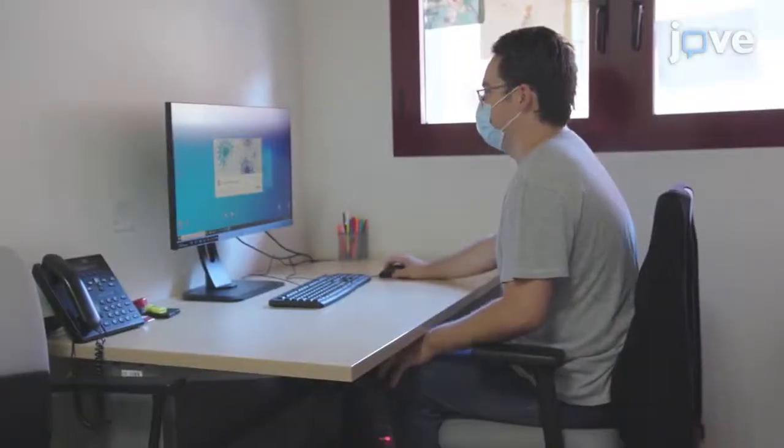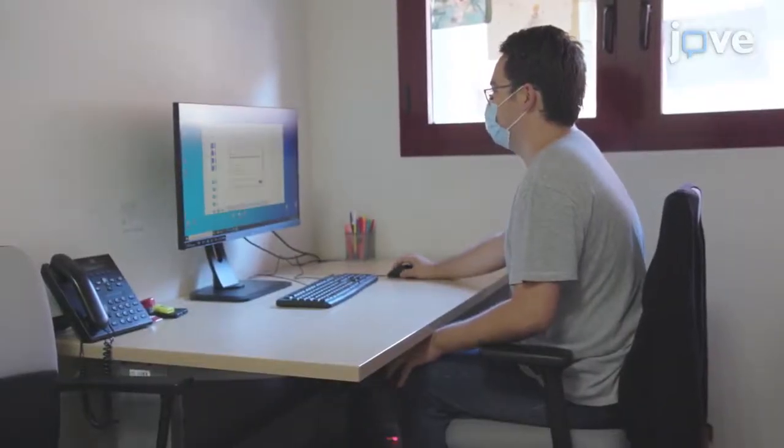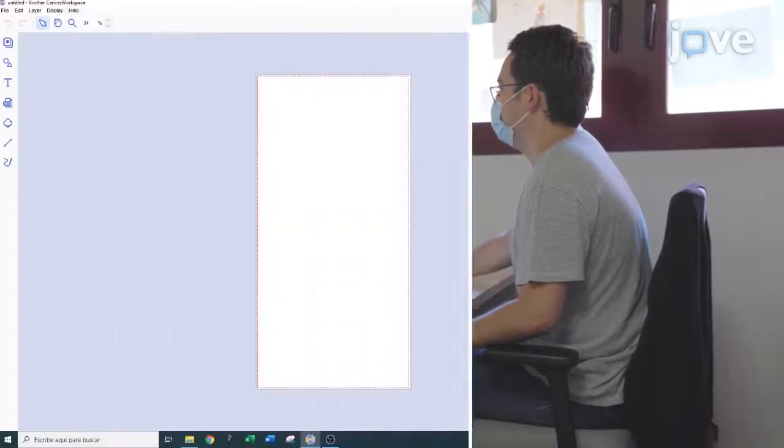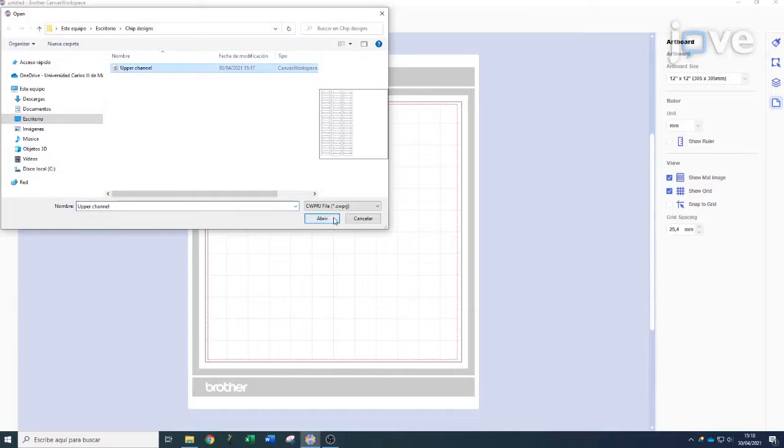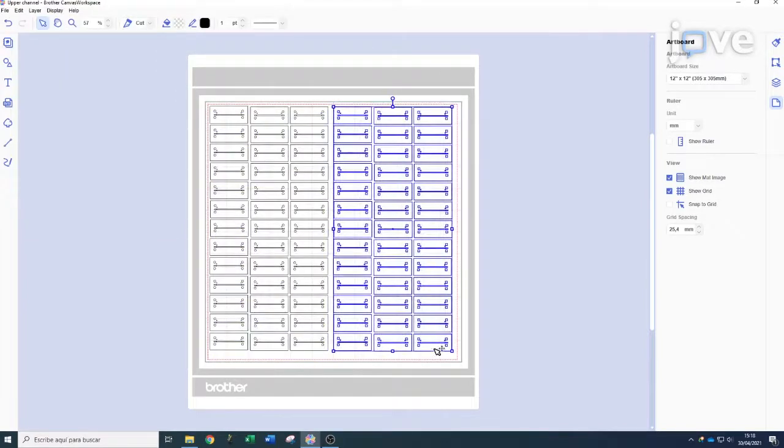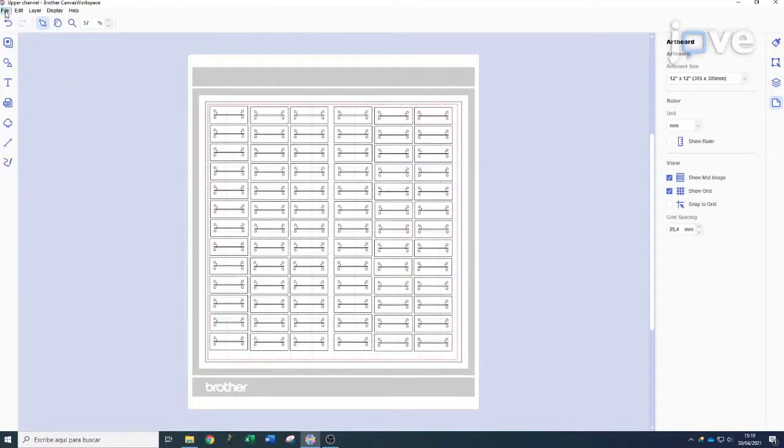Begin by designing a microfluidic chip using Brother Canvas Workspace software. Create a 30 x 30 cm workspace and fill it with the design patterns for the different layers of the chip before storing it in a .svg file.